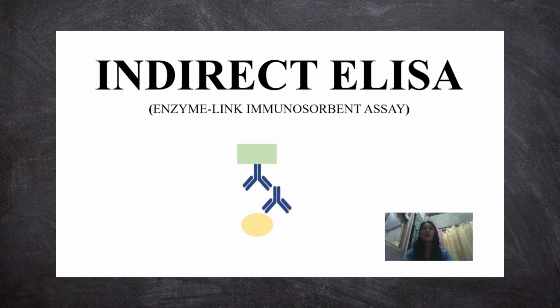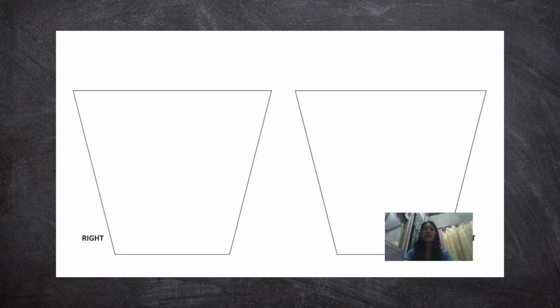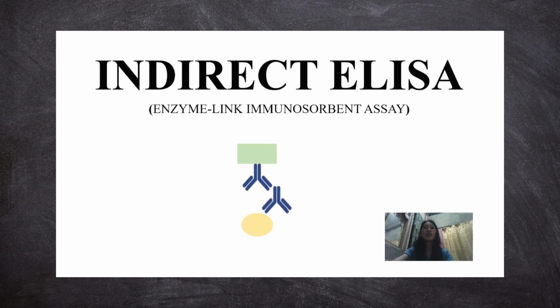So now let's proceed to the indirect ELISA. Indirect ELISA is the second type of ELISA. In indirect ELISA, the antigen is immobilized similarly, but instead of directly adding the enzyme-linked antibody against the antigen, a primary antibody that binds to the antigen is used. Then a secondary enzyme-linked antibody that binds to this primary antibody is applied. This secondary antibody enables the detection of the primary antibody and consequently the presence of the antigen.